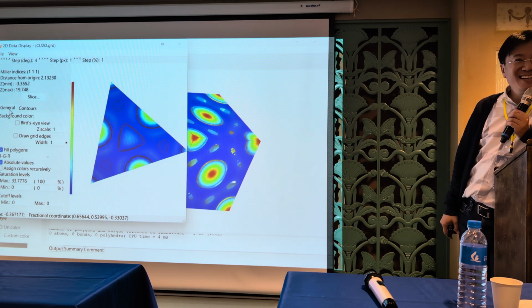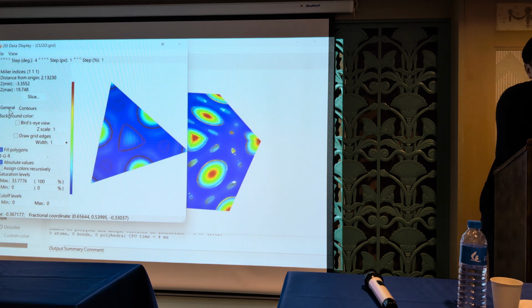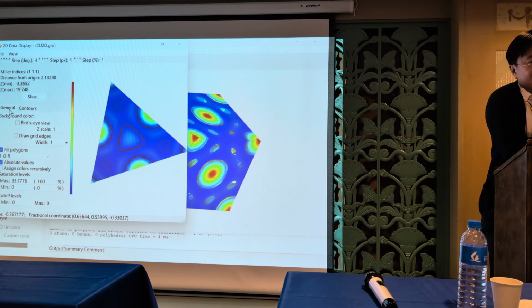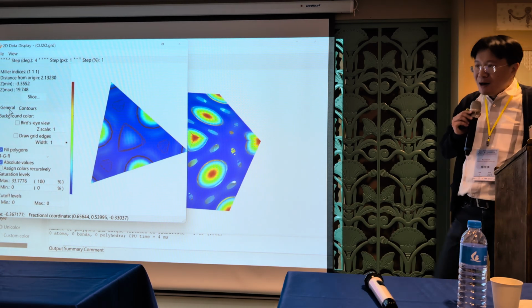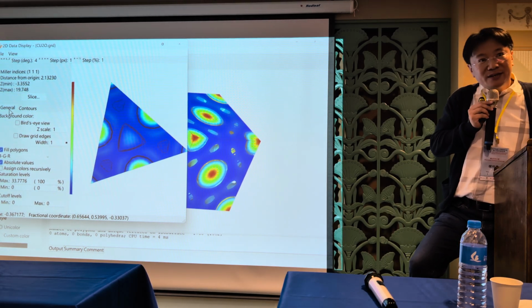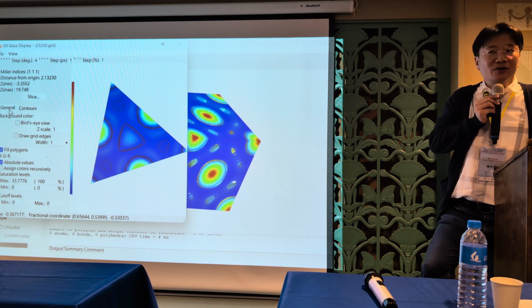So any more questions? If it is an anisotropic crystal, like a 2D material, how to judge the preferred orientation, the weight of preferred orientation? That's a tough question. If you want to calculate the preferred orientation, in Jana2 there is only one preferred orientation axis.